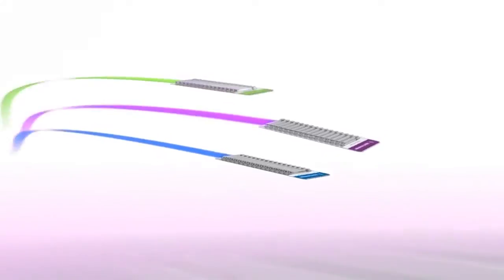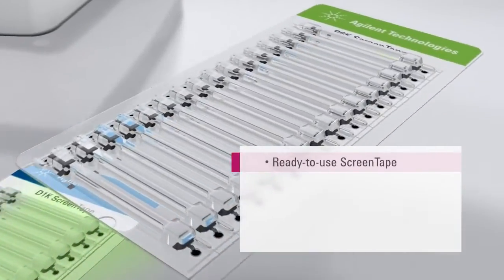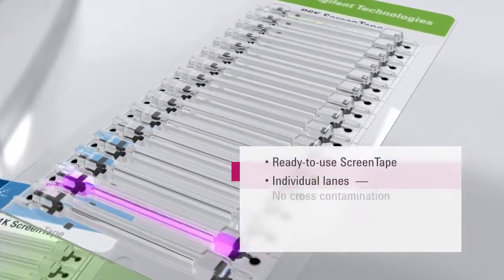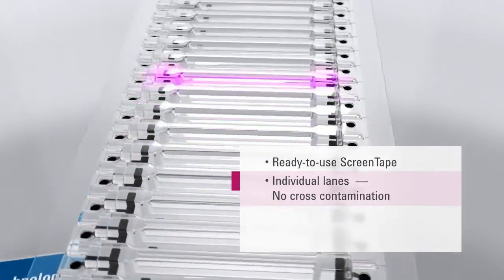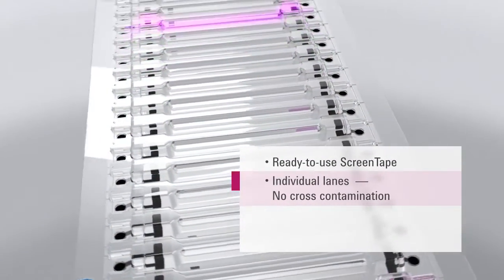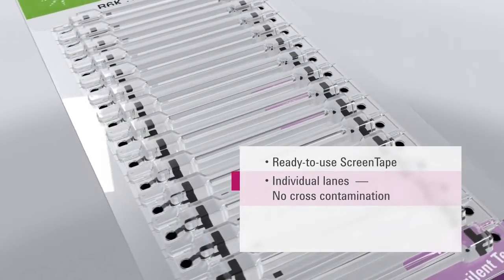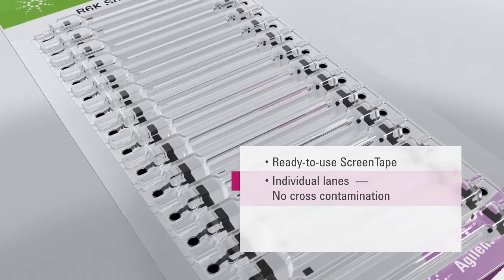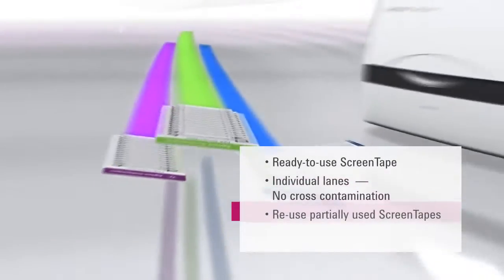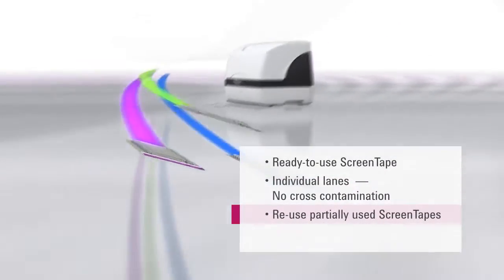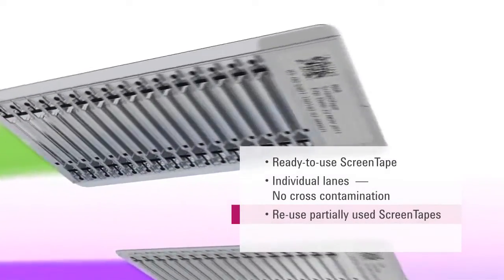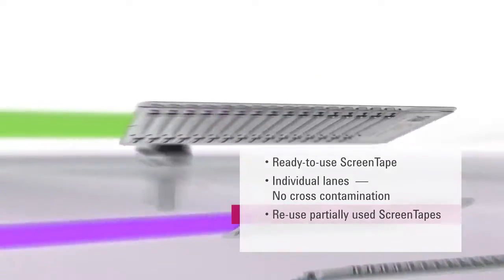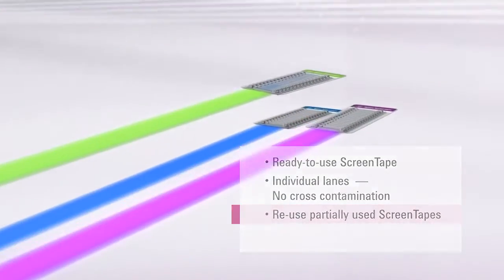The disposable screen tape contains lanes for individual sample separation, eliminating cross-contamination and sample carryover. Partially used screen tape can be used for analysis at a later time, for increased flexibility and scalability.